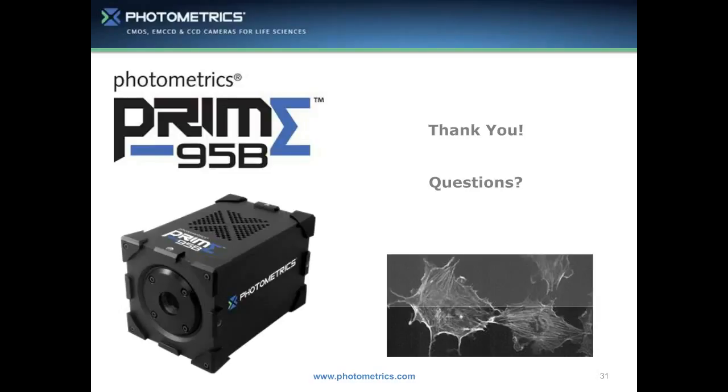So let's get started. Our first question is, how about deconvolution of image stacks from the 95B back illuminated? Where do we get in terms of resolution? Sure. How about deconvolution of image stacks from the 95B back illuminated? Where do we get in terms of resolution?